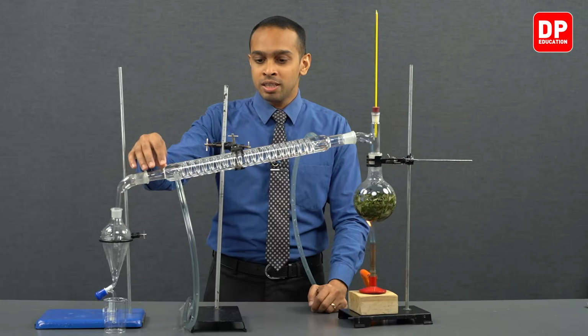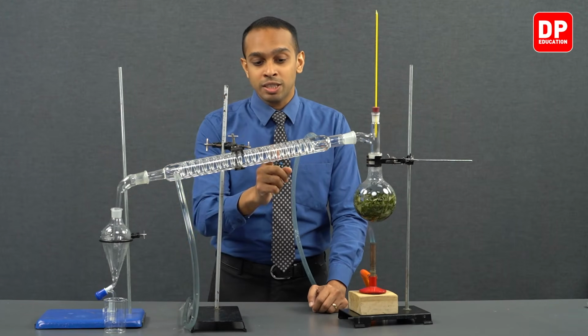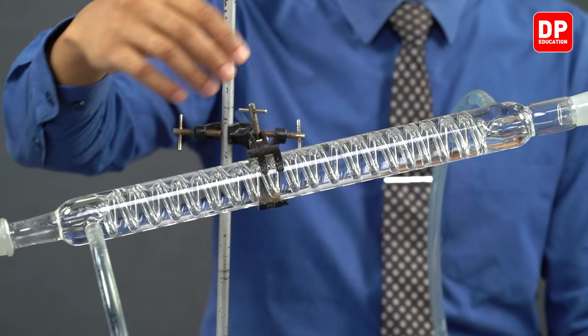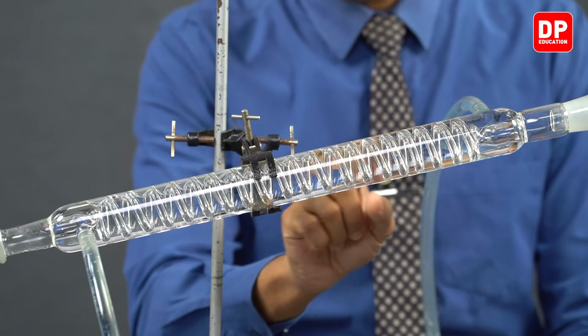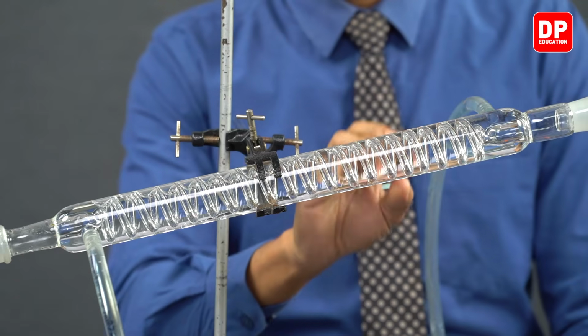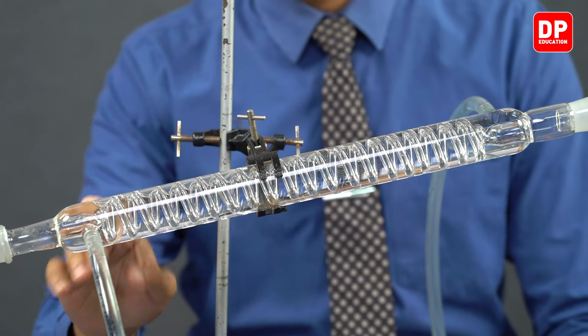As you can see, there's a water jacket around this spiraling glass tube you can see inside this condenser. So water is currently running from the bottom of the condenser all the way to the top of the condenser. So whatever vapor enters this condenser will cool down as it moves from the top of the condenser all the way to the bottom.